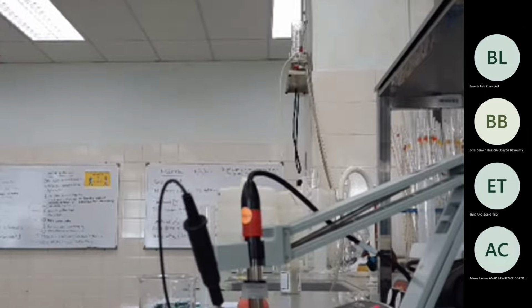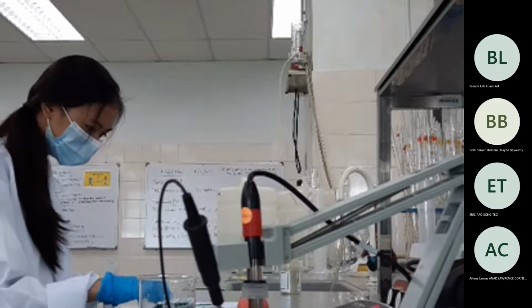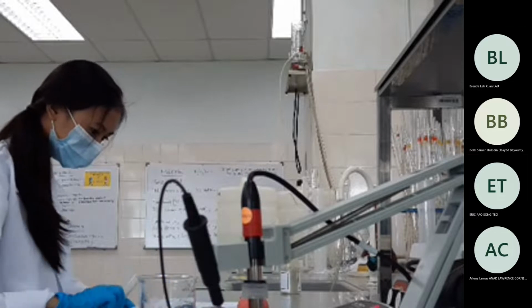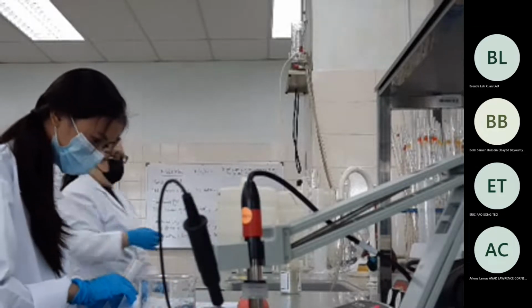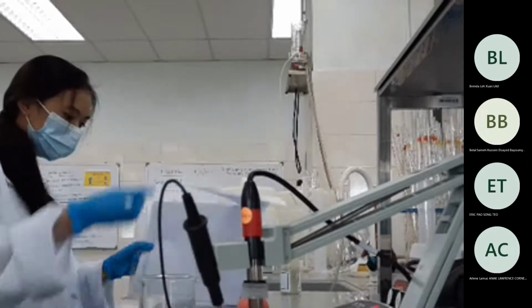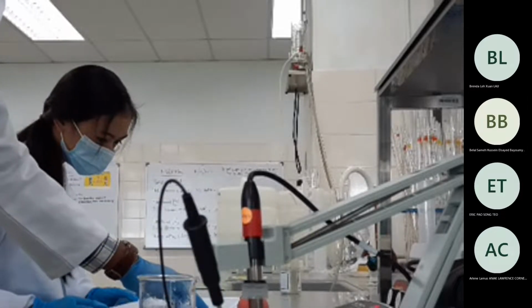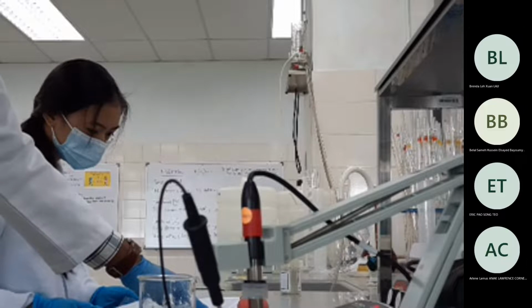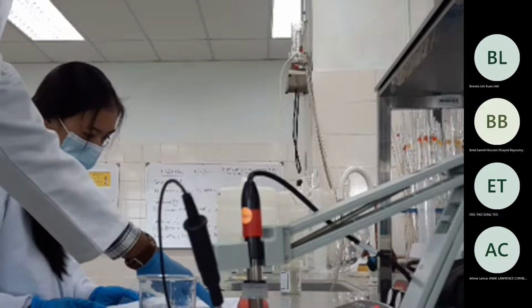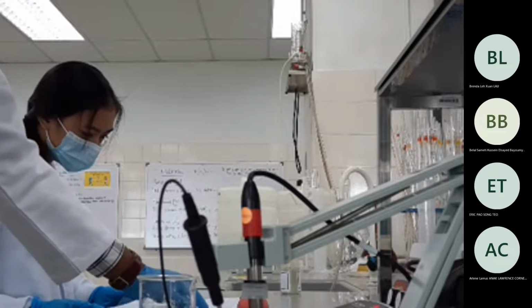And then take 50 milliliter of... So this here is 50 milliliter of sodium ethanoate, which is sodium acetate as well, and then 50 milliliter of acetic acid, which is ethanoic or acetic acid, same thing.